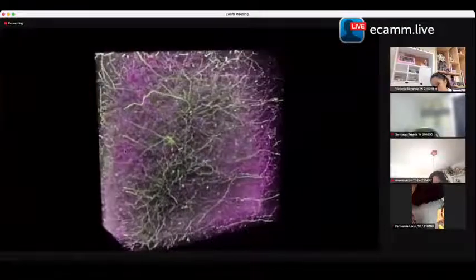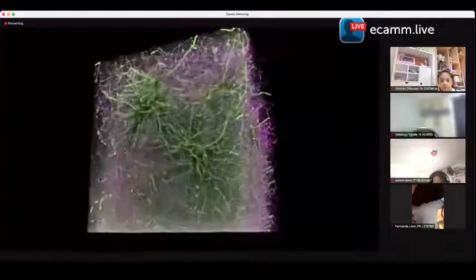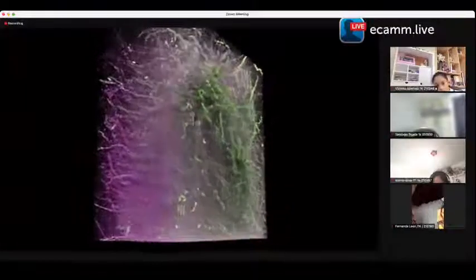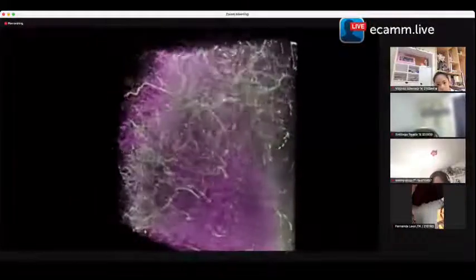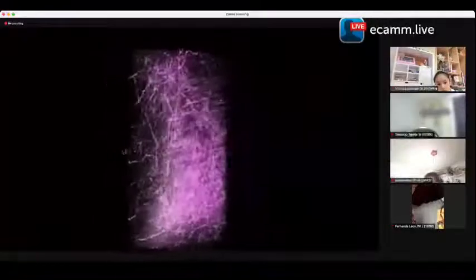In this example, we injected purple dye into a far distant brain region called the amygdala, which is largely where our emotions and feelings of fear are generated. The purple wires are axons, or connections, coming from the amygdala into this area.